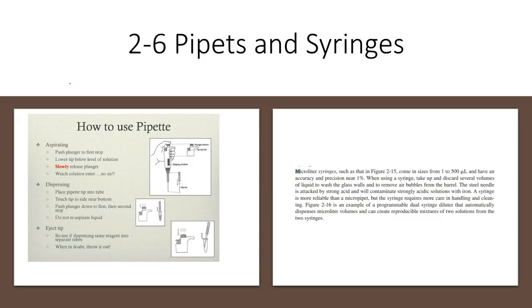Pipets and syringe. How to use a pipet? You need to do three things: aspirate, dispense, and eject the tip. First, push the plunger into the first stop. Then lower the tip below the level of solution. Then slowly release the plunger and watch solution enter. Make sure there's no air.